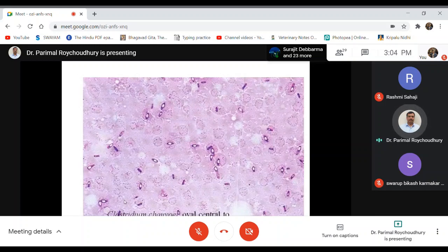This is a very pathogenic bacterium of animal species, Clostridium chauvoei, that causes the disease black quarter. This causes a necrotic myositis condition. The whole muscle gets rotten because of this bacterial infection. They are under the group of Clostridium. They are anaerobic bacteria, and they produce spores. And the spores are lemon or almond shaped, bulging out of the exosporium, and basically present in the subterminal region.